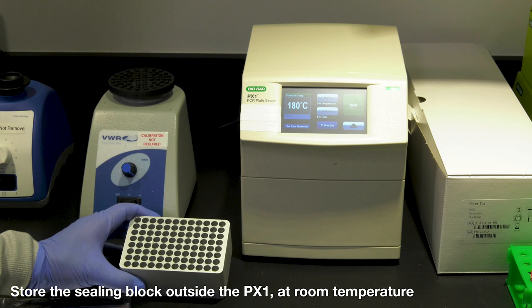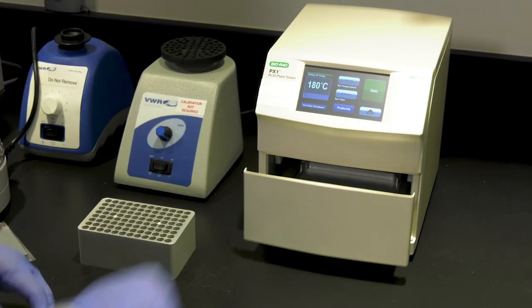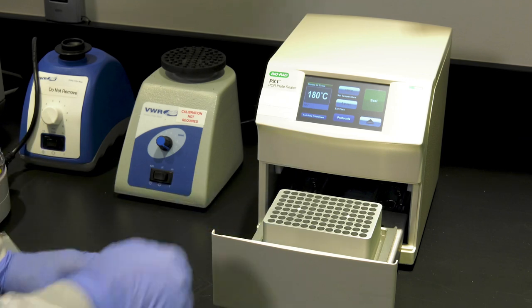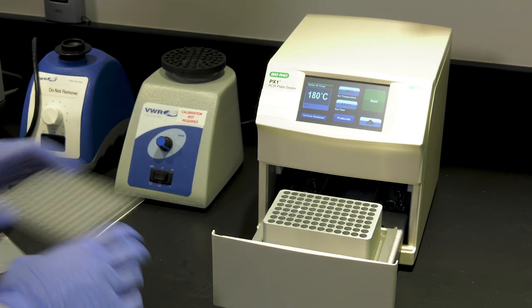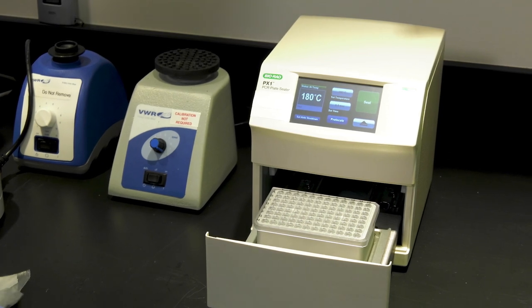If the block is hot, it could potentially hot start your reactions prematurely, so always store the block outside of the PX1. Open the PX1 and place the block securely in the holder, making sure that it's fully seated. Place the DD-PCR 96 well plate with your reactions into the block.